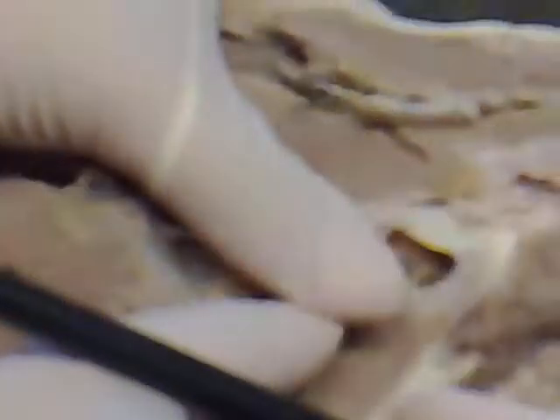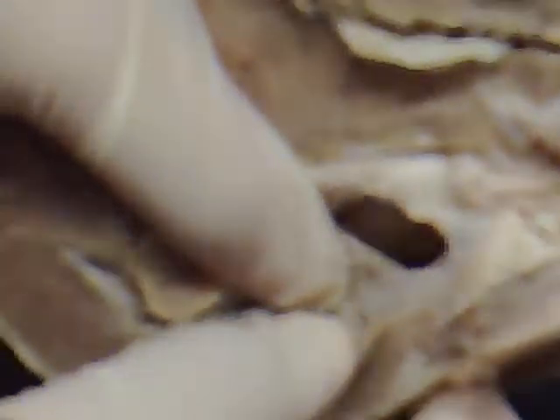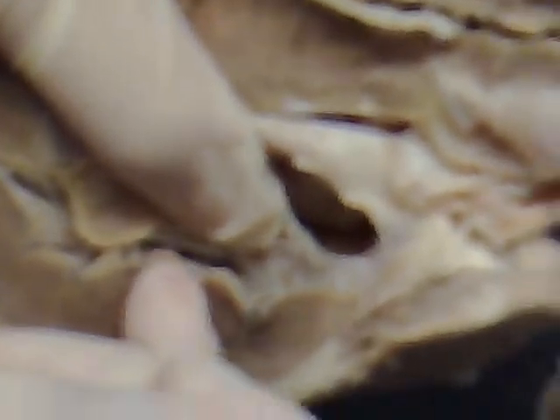The pectinate muscle is right here. Check to the other side — right there, yeah, right there. The superior vena cava is right here, and they're right next to each other. The inferior vena cava is right here — yeah, they're right next to each other.